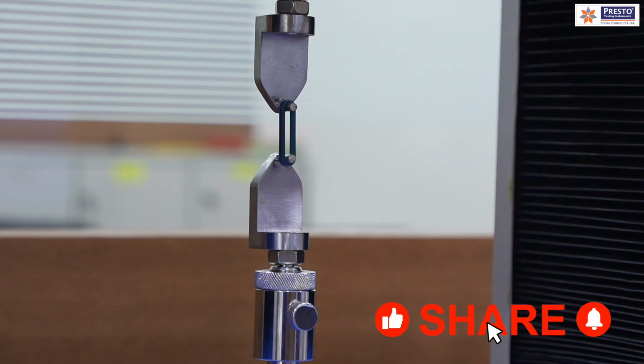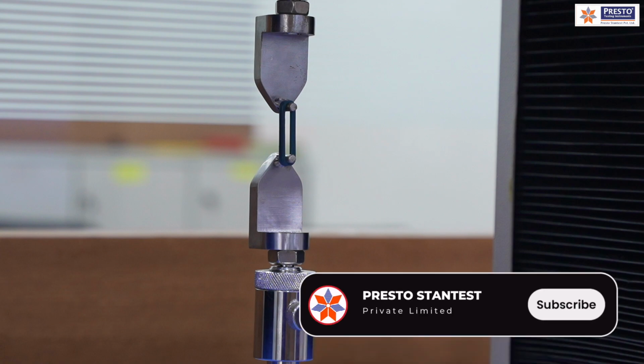After 100% elongation, we have to see whether the sample has torn, broken or cracked in this elongated condition. That is also known as proof load testing, to see the impact on a sample held stable under stress for a fixed duration. Then we have to see the deflection on that sample. This is how the tension set test is performed.